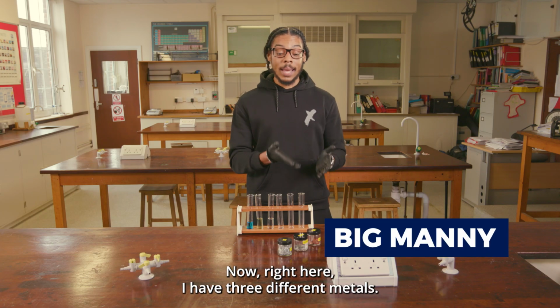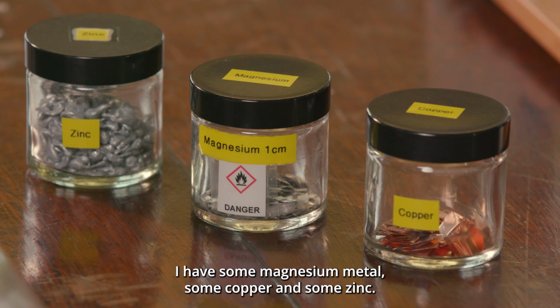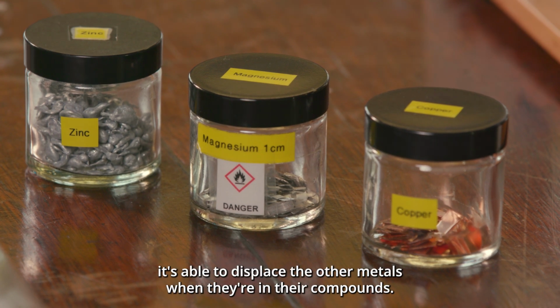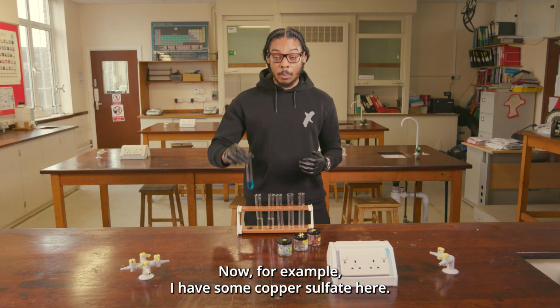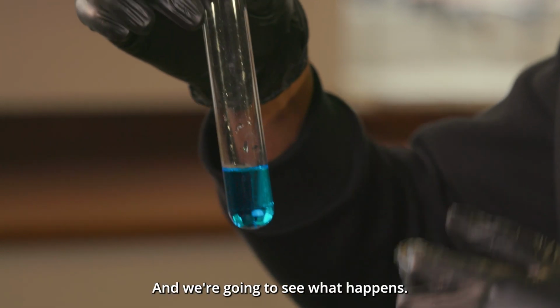Alright, cool. Now right here, I have 3 different metals. I have some magnesium metal, some copper, and some zinc. Now magnesium is the most reactive out of all of them, so it's able to displace the other metals when they're in their compounds. Now for example, I have some copper sulfate here, and we're going to add some magnesium metal to the copper sulfate, and we're going to see what happens.